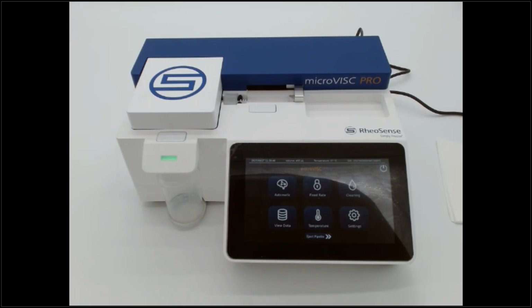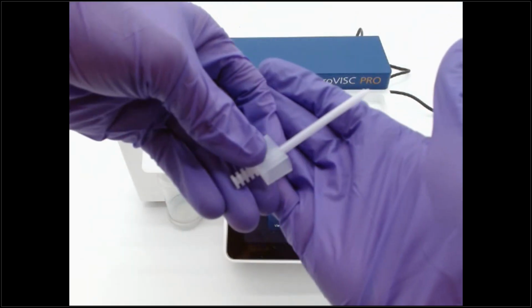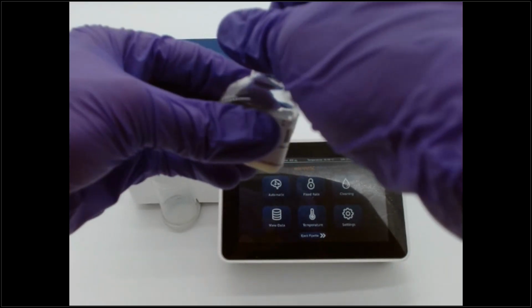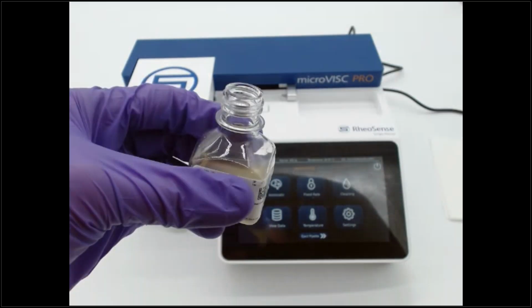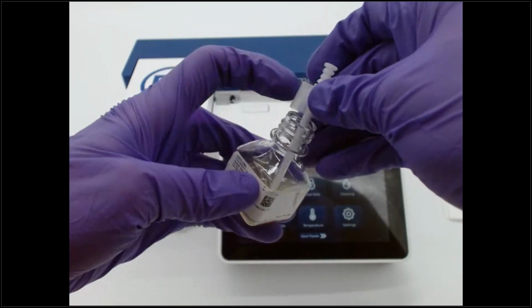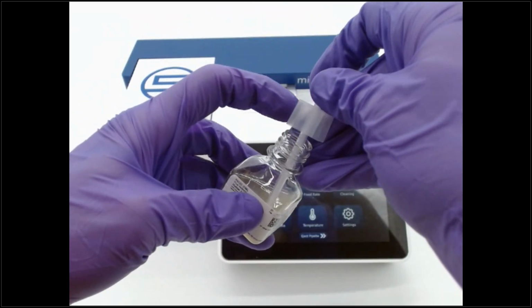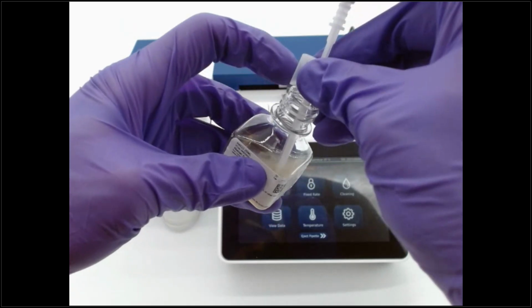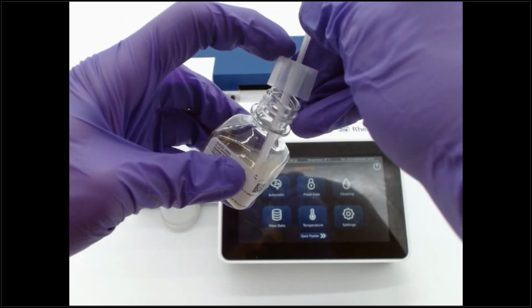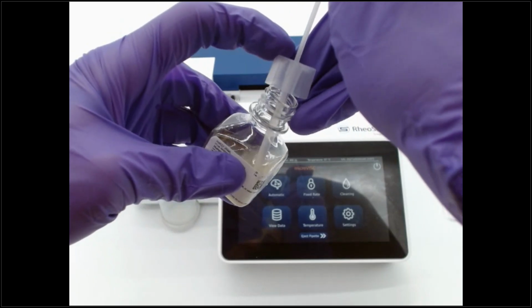So let's go ahead and load the disposable pipette with our sample. So we take a disposable pipette here. There we go. And then I'll take my sample. And then I'm simply going to just load it, just like you would load most samples with a pipette.